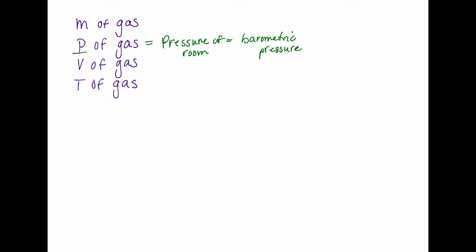Now we can measure barometric pressure by using a barometer. And we have one of those in our lab. But we could also look up a barometric pressure that somebody else has measured for us. So as long as we can do one of these two things, we can measure the pressure of the gas.